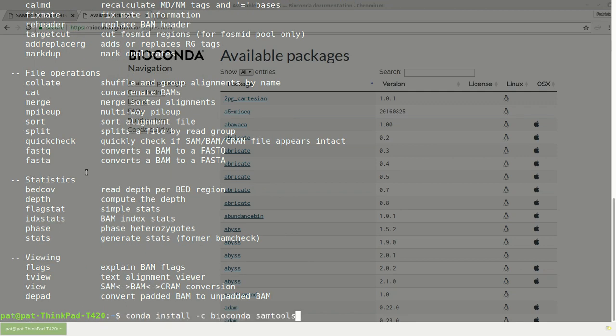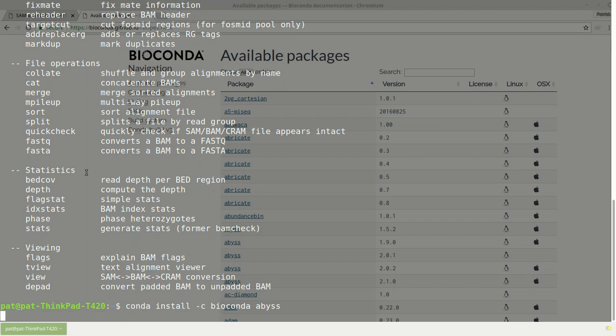But, let's say I want to do some de novo assembly. I'm going to install Abyss. And there it goes. For me, this is the absolute easiest way to get up and running.